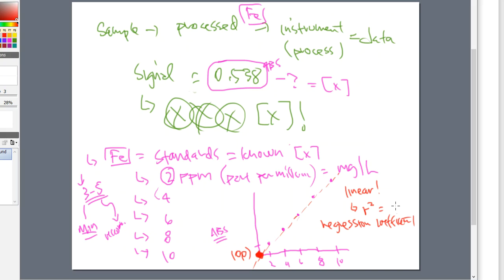But folks, this is what we call calibration standards. So we are making something in the lab of known concentrations and we run them. What we hope to see is a signal increase. As we increase the concentration, the signals or the responses should go up and up and up. Most of the time, it should be a linear relationship, and this linear relationship lets me know, did I prep something the proper way? So there should be a cal curve, number 1, for all of the analytes that I want to measure. So in this particular example, I want to measure iron, and I'm going to make a standard solution of iron. I run these solutions or these standards on the machine and generate a curve. Great. That's what we do it for.